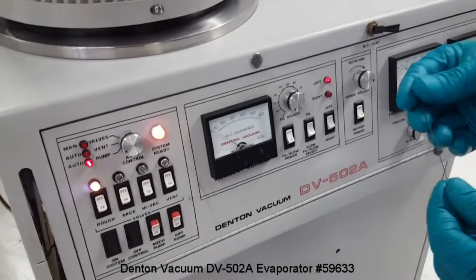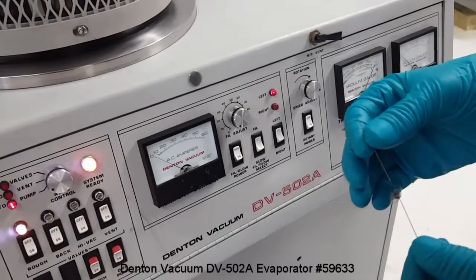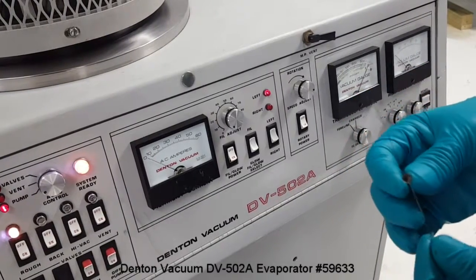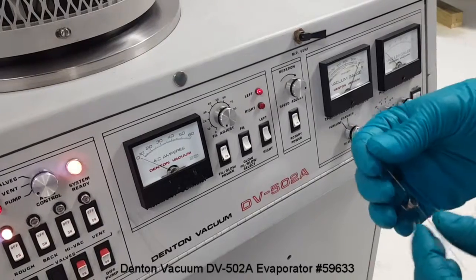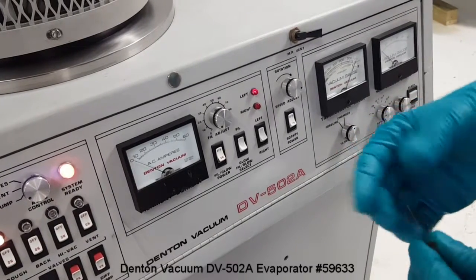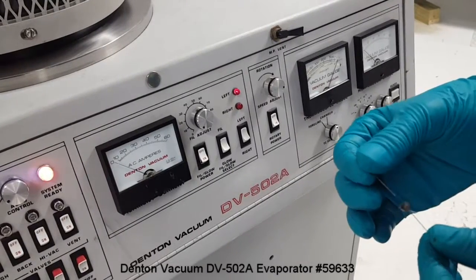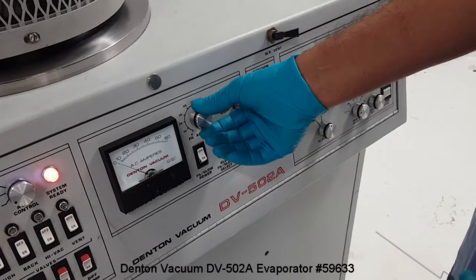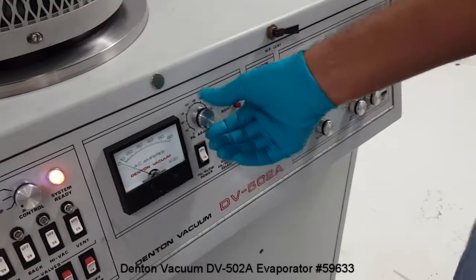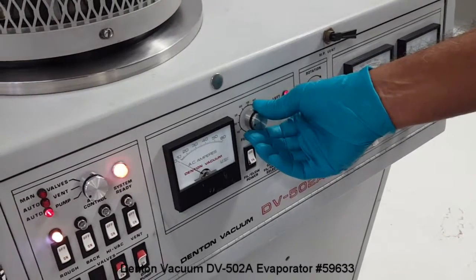This is a tungsten filament evaporator I'm testing with. Various sizes and shapes of tungsten boats are available. Care should be taken in order to match the specifications of the system given in the user's manual details. While increasing the current, the current adjust knob should be turned on and raised very slowly.